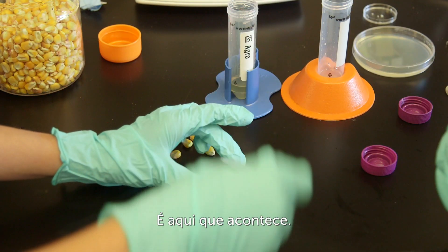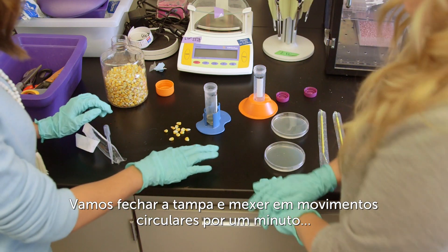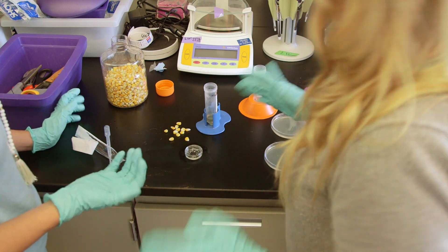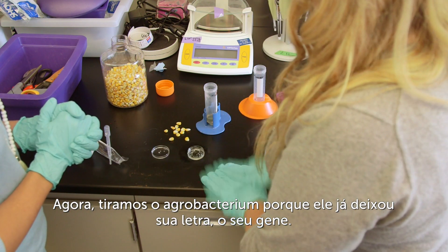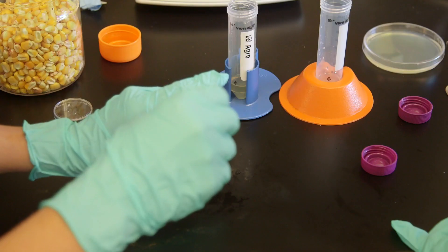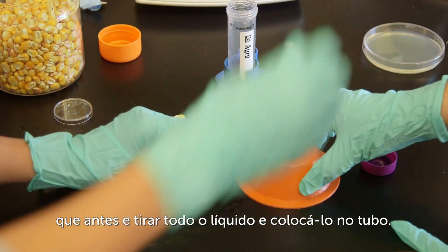All right, so this is where it happens. We're going to close the lid and you're going to swirl it around for one minute. That's it. So we're going to take off that agrobacterium because it's already delivered its letter — its gene. It's done doing its job. So you're just going to do like you did before and take off all the liquid and dump it into the conical tube.